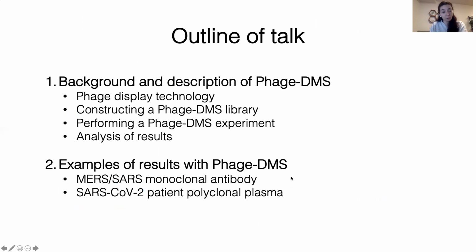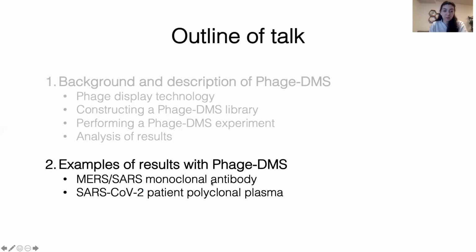And so now I'm going to walk us through some examples with some SARS antibodies from either a monoclonal or polyclonal plasma.